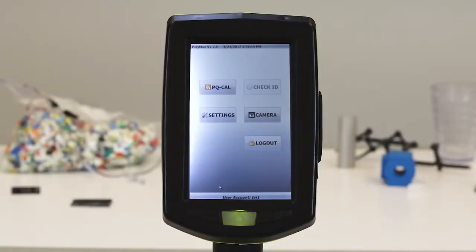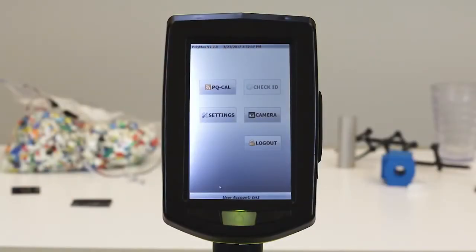Here we see the main screen of the Polymax. The first button we find in the upper left is the PQ-Cal button. Before we proceed, notice that the Check ID button is not currently active. This function will not become active — which means you cannot begin to analyze your plastic samples — until you have successfully completed the PQ-Cal.